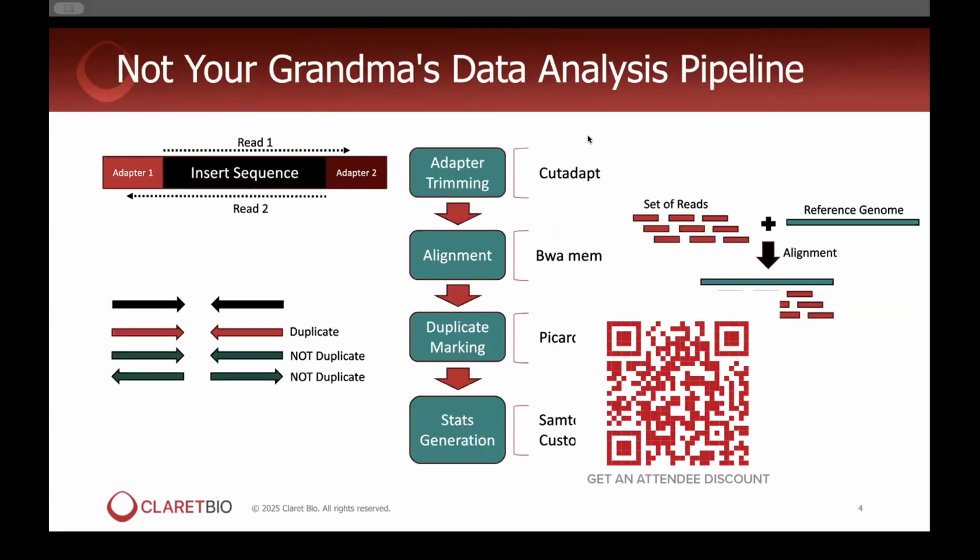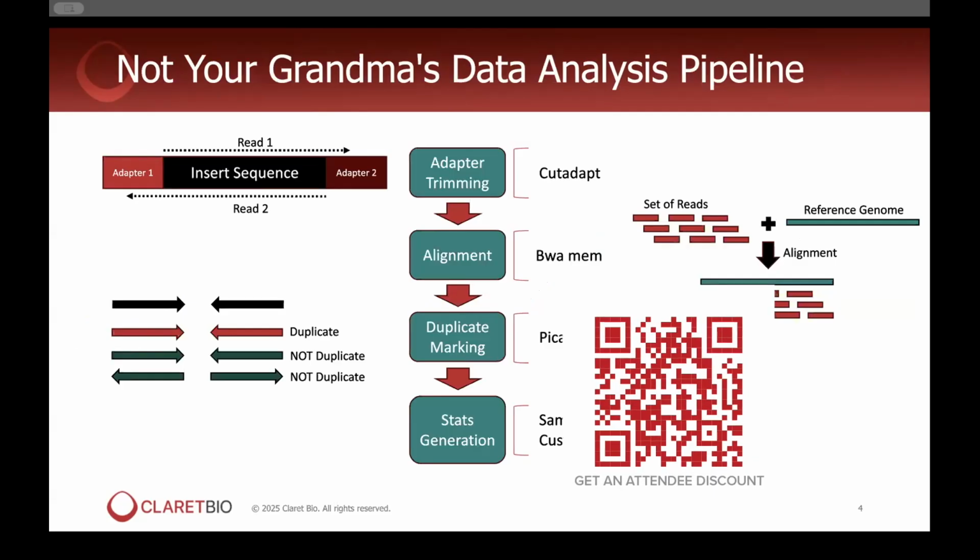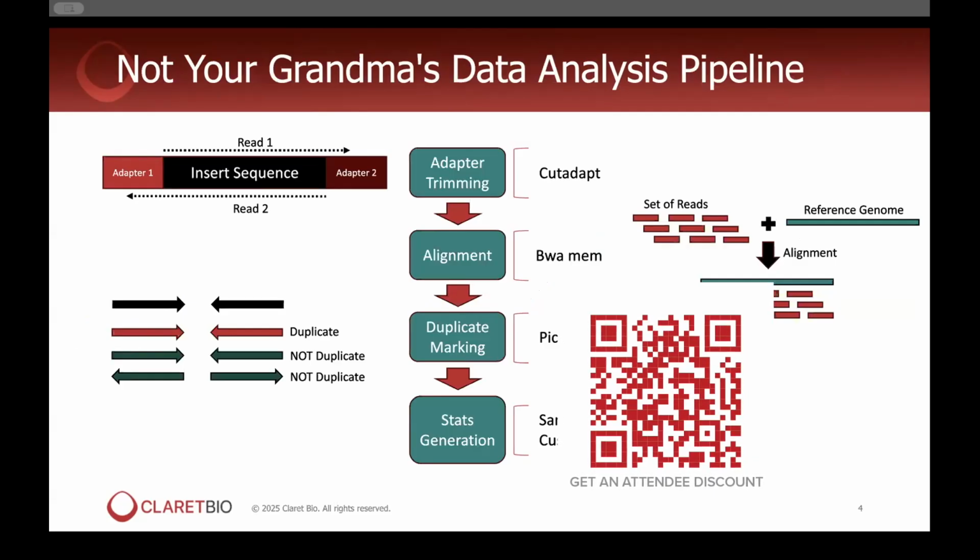This provides an overview of what's going on behind the scenes in the Seriously Run software. I've highlighted the main components of the pipeline as well as brief diagrams of what's really going on with these tools.